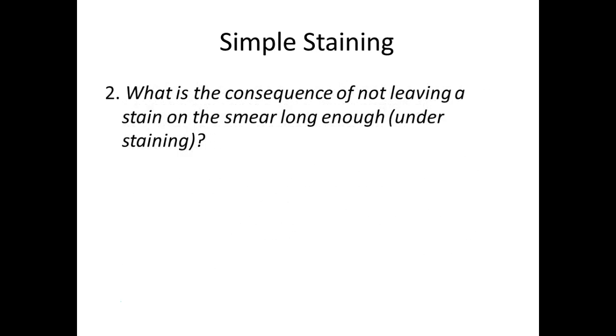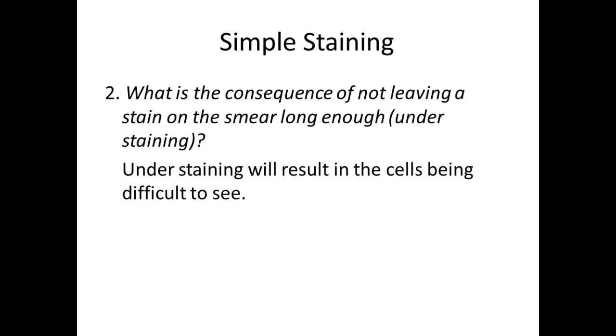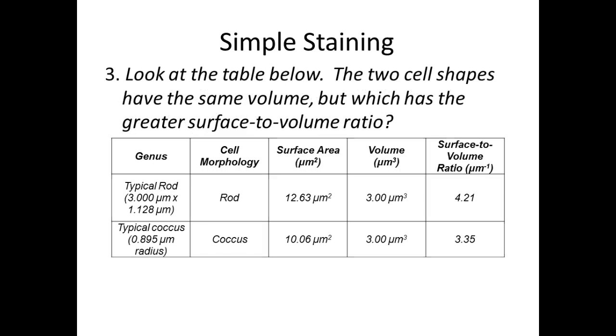So what happens if we don't stain them long enough, or we understain them? What's the problem with that? They're not going to be visible. The whole purpose we're staining them is to create contrast to see them, right? If you don't create enough contrast, you're just not going to see them. It's going to be very difficult to see them, which is the case with some of the lighter dyes and some of the procedures that we do. They just don't stain well.